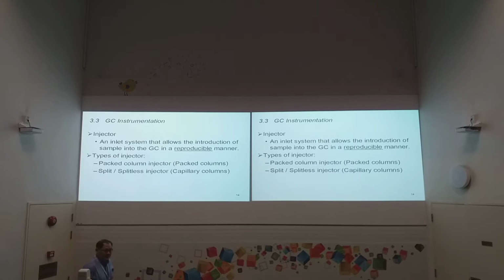But one thing I want you to pay attention to is in the previous lecture we actually discussed that the GC technique is a powerful technique, but obviously it cannot solve all problems. That means it's not applicable in every scenario, right? So there's a limitation. If you want to study certain compounds, which compound is more suitable for this particular technique? This one we discussed. Can anyone of you still recall?